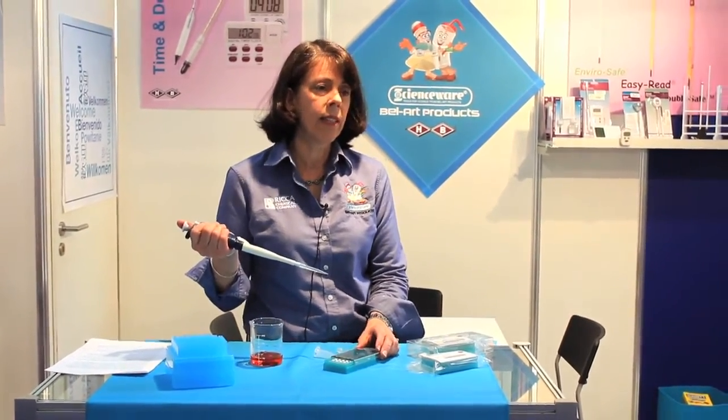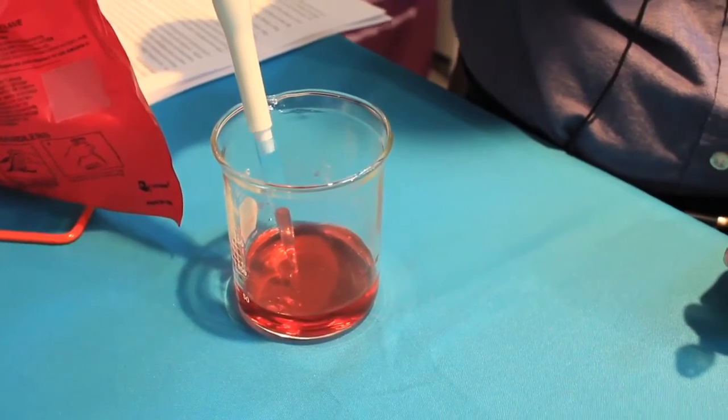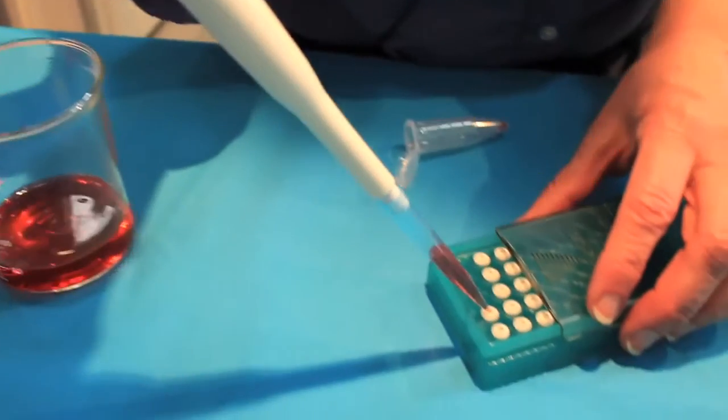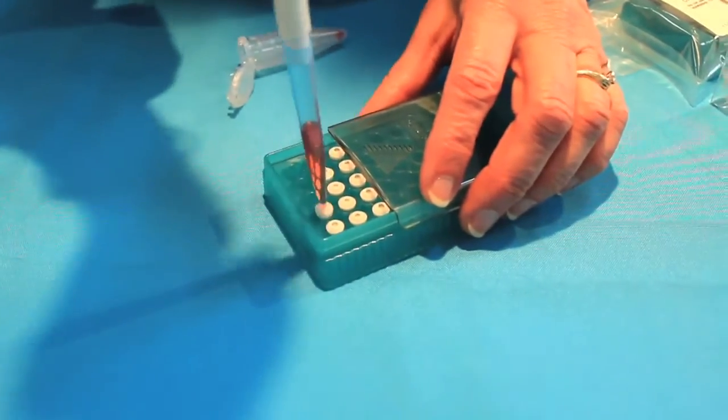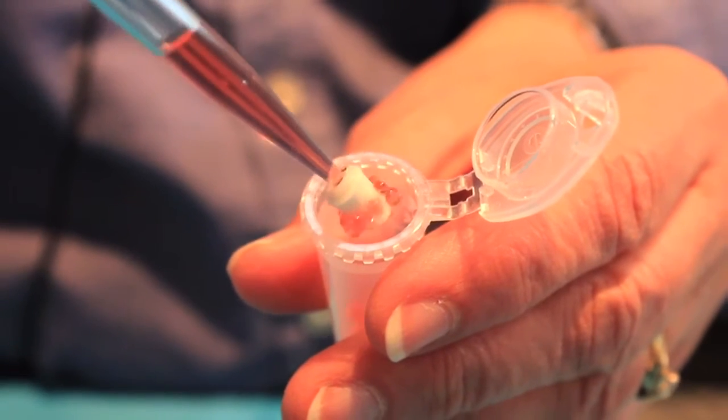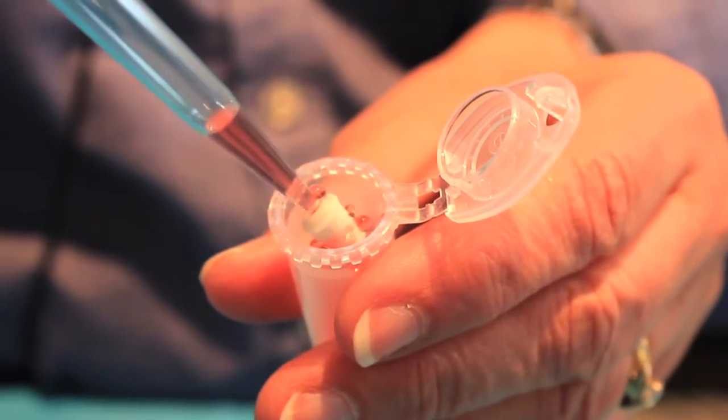Let's take a look at how FlowMe works and then we can get into some of the details. After aspirating my sample into the pipette tip, I simply press FlowMe onto the end, and then I dispense my sample through FlowMe into my container.